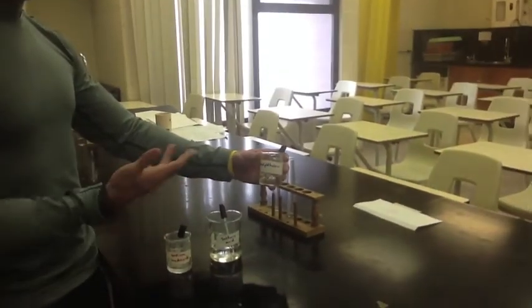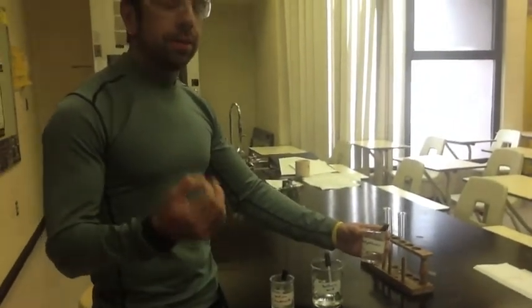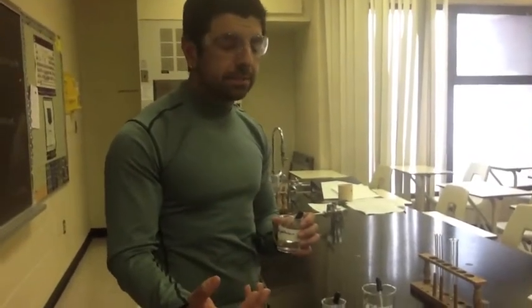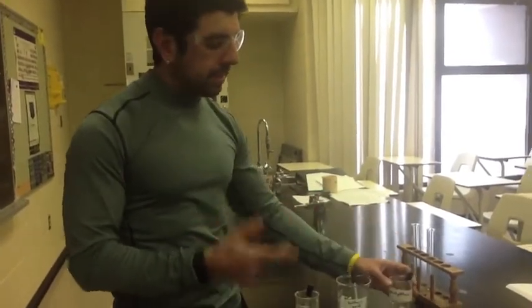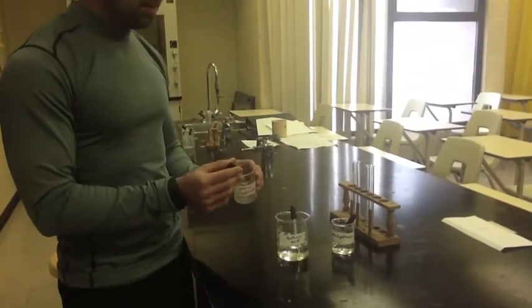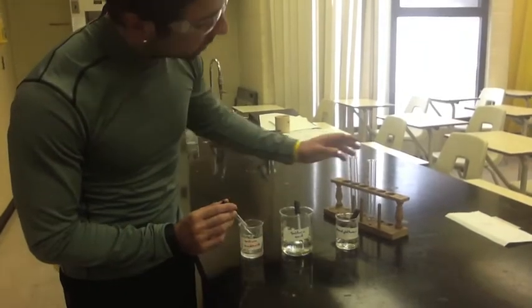We've got one more beaker here. It may come in beaker form, or it might come as a little vial of phenolphthalein. For those who understand, phenolphthalein is an indicator. It indicates if something is an acid or a base. So in this demonstration, just like with the other stations, we're going to do 3 eyedroppers full here of each chemical.